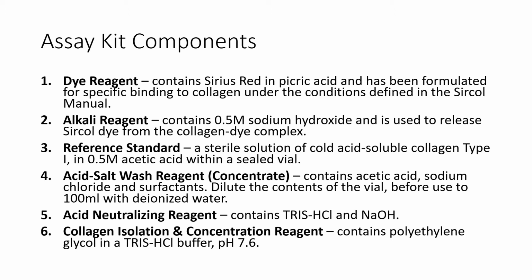One is the dye reagent, which contains that all-important Sirius red dye, which is used to target collagen within your sample, and it binds to it. When it does, that can be detected using a spectrophotometer, and the absorbance can be read.